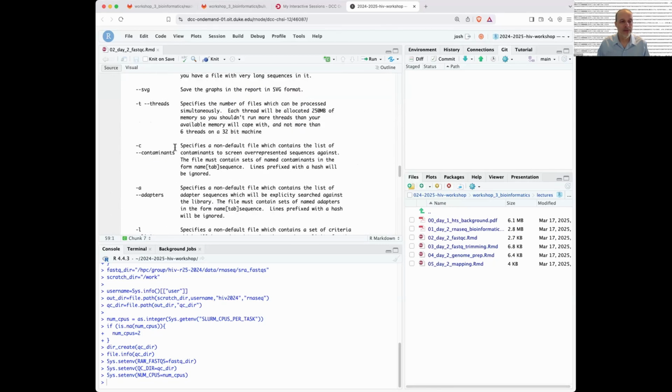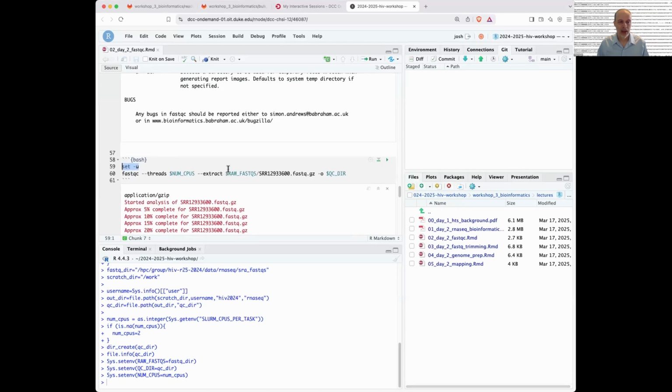To actually use those variables within Bash, we have to say $ and then the name of the variable. If we misspell this variable name, with set -u, it would actually give us an error message saying, I don't know what that variable is. Without set -u, it would just go happily along. Many programming languages would give you an error, but by default, Bash does not. So having set -u tells it, give me an error message if I misspell things.